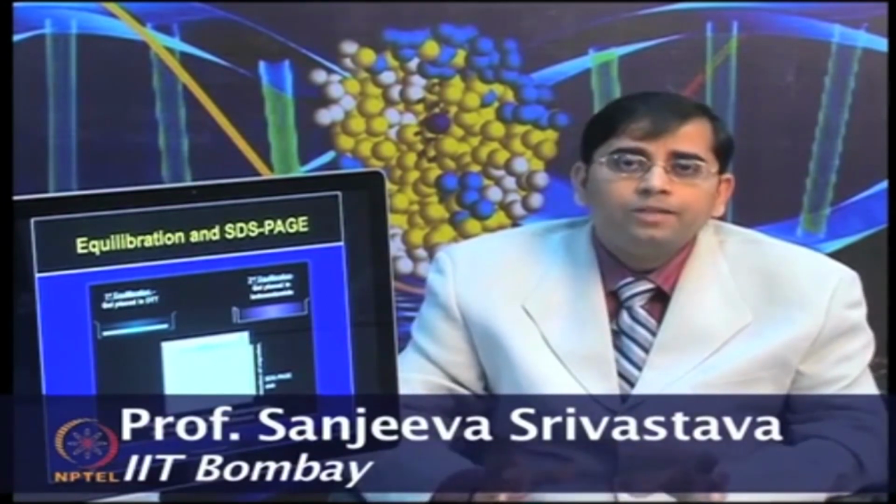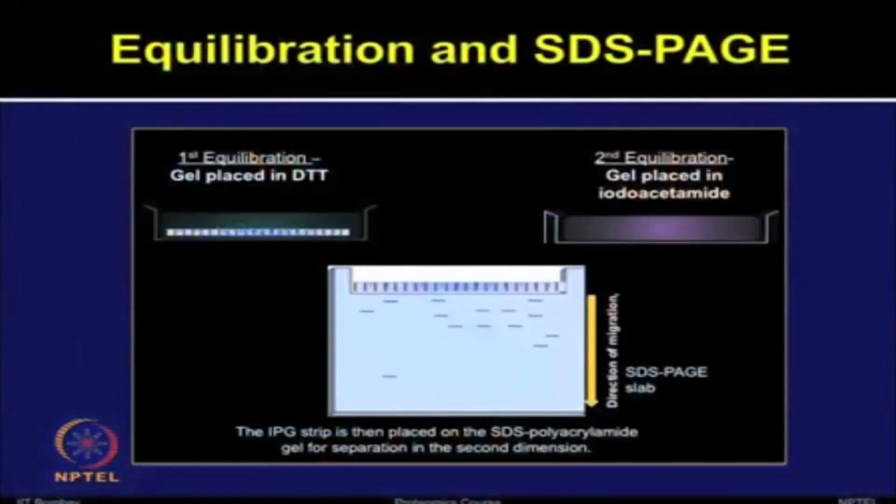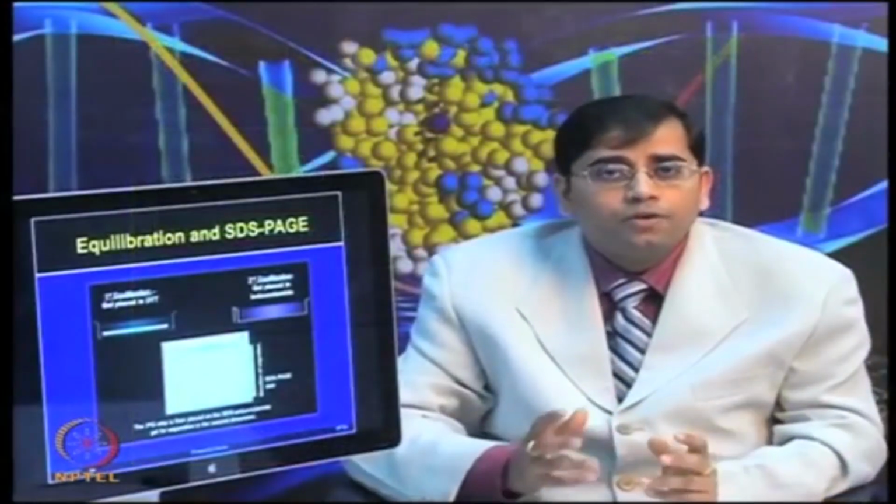So, overall the steps, as you can see, are exactly the same as what one does in two dimensional electrophoresis. The only variation here is that all your control and treatment samples have been mixed together and now they are separated on one IPG strip. Now, this strip is placed on one SDS-PAGE gel and all the proteins will be separated in one gel itself, whether they come from the control or treatments.